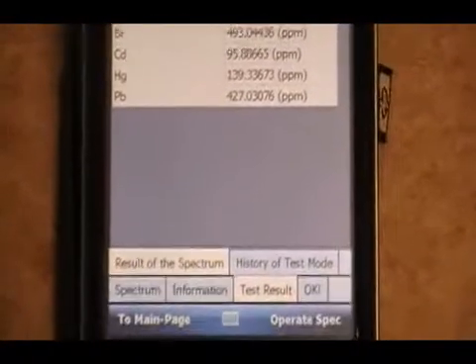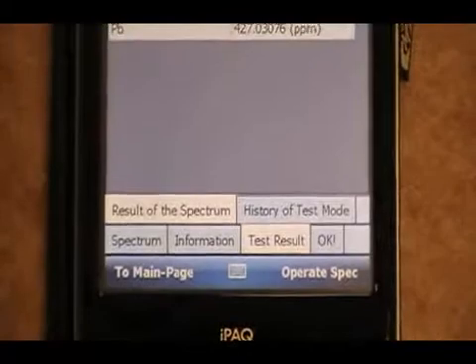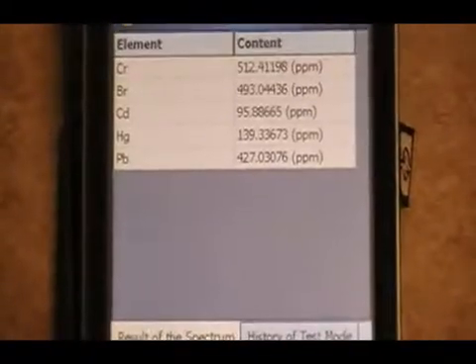So as you can see, even at 40 seconds, the numbers are already coming closer. It'll only get better in time.